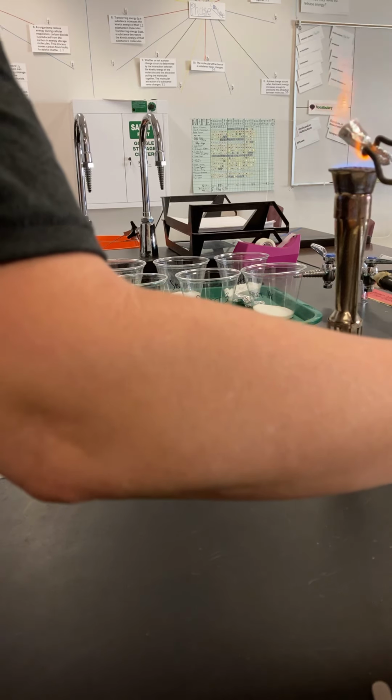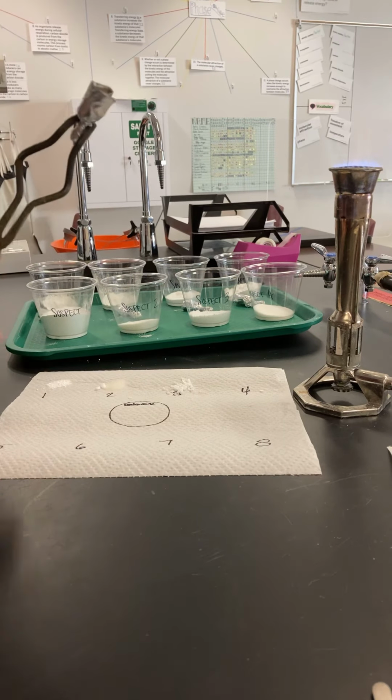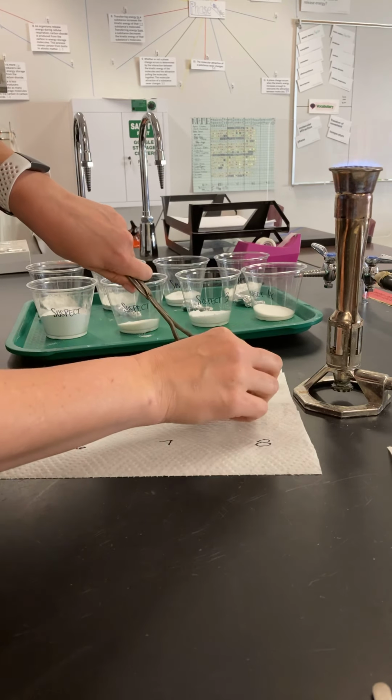1, 2, so it's already starting to melt. 3, 4. So this one, oh, notice it started on fire. So this one definitely melted. I don't know how much of it I'm going to be able to dump out.